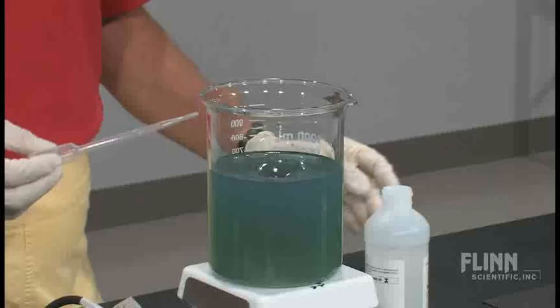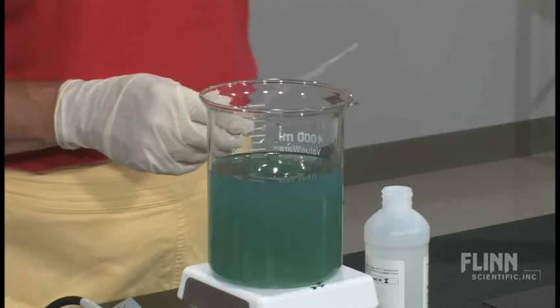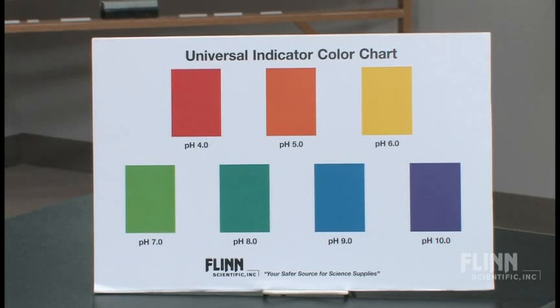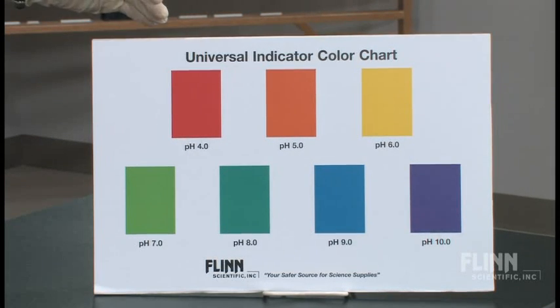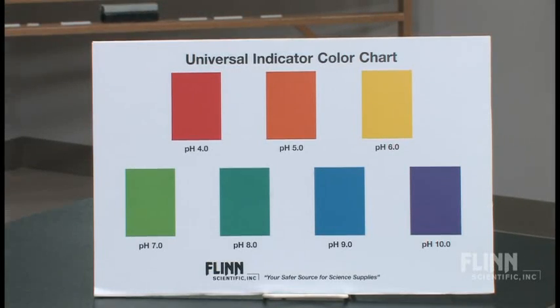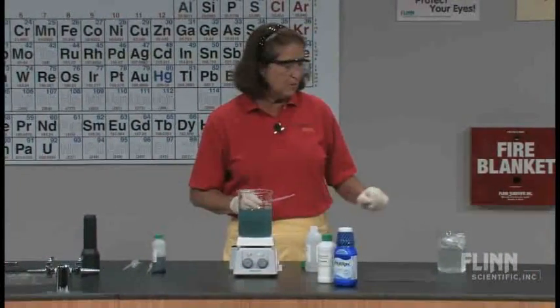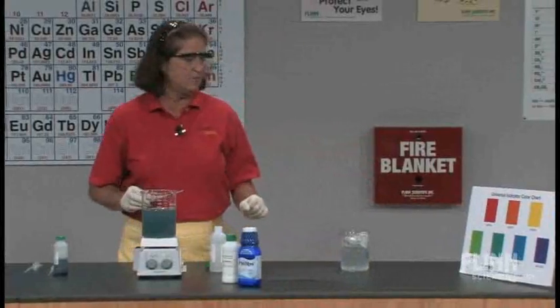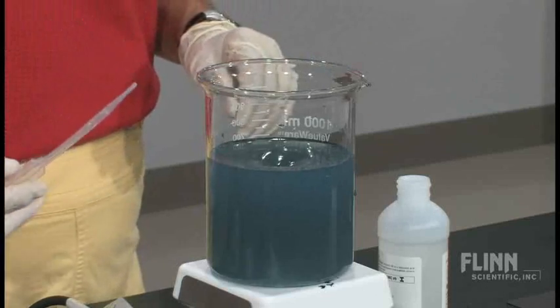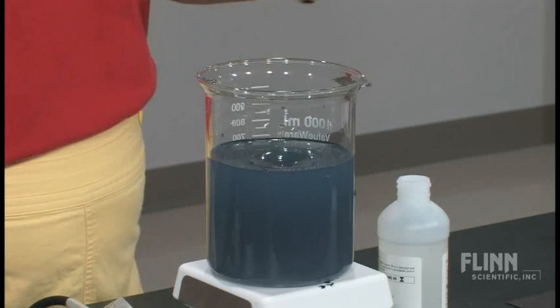And you see what happens — an initial red indicating a very low pH. We saw a flash of red, and then we went through the color changes from red at around pH 4, maybe a little orange at pH 5, then yellows and greens. We'll notice that at this point we're probably somewhere between a pH of 8 and 9 — it's got a nice blue color. If we were to let this continue to stir, what would happen is we would go back to a deeper color, more towards a pH of 10.